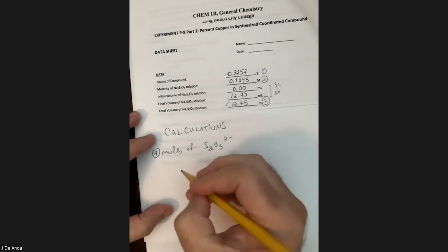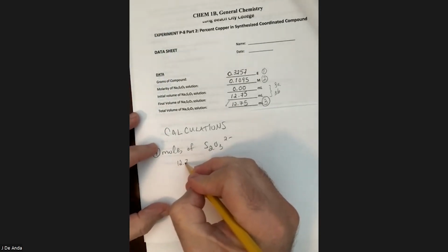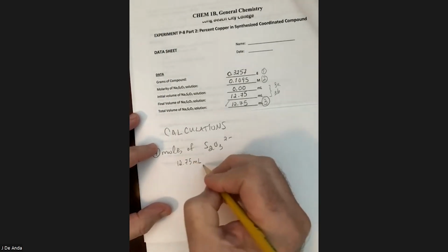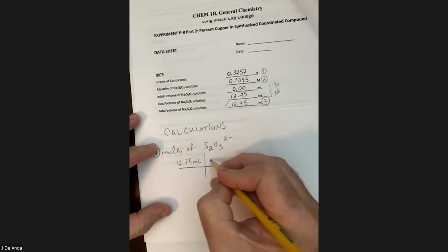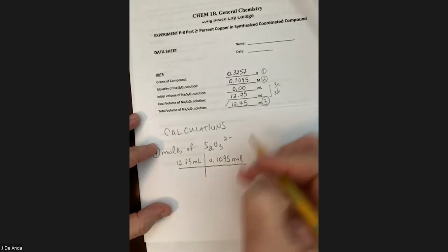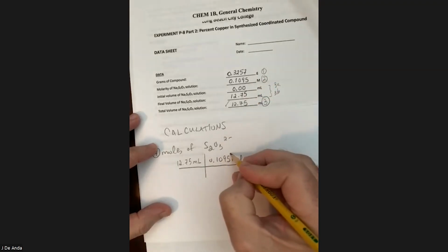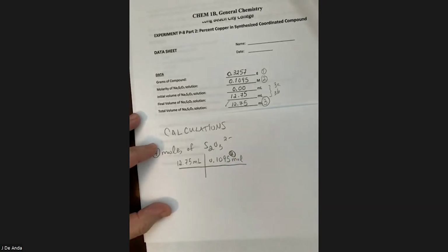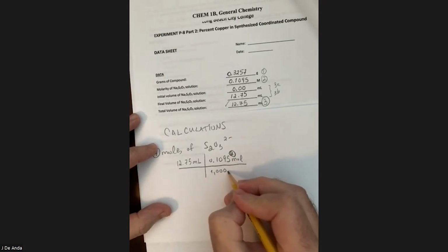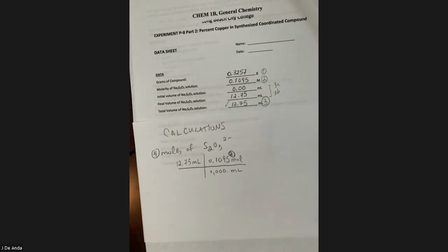So we had 12.75 milliliters of thiosulfate, and our solution had 0.1095 moles. You can see that here, number 2. And this is per liter, but we're going to go ahead and make that 1,000 milliliters. That's a liter. And that way we can do a straight calculation here.